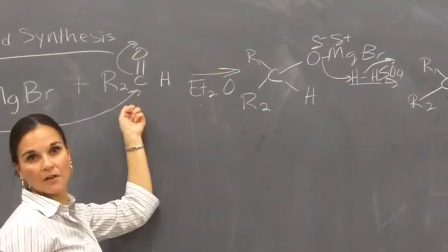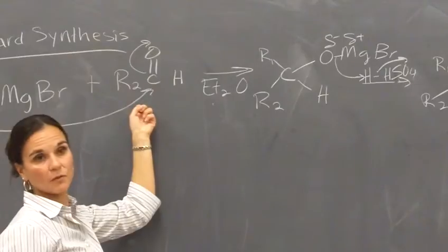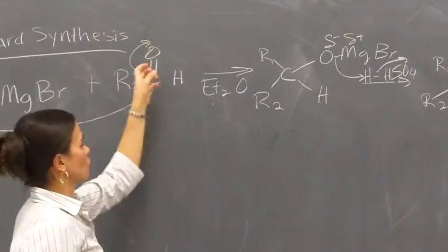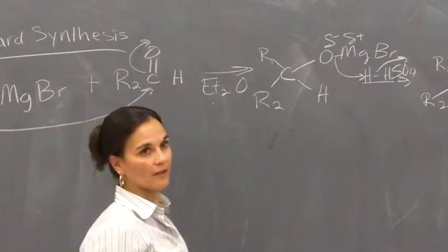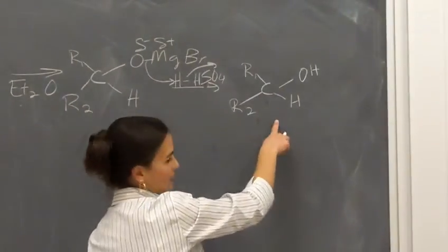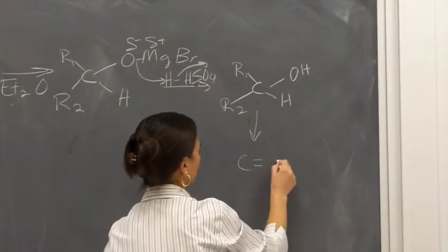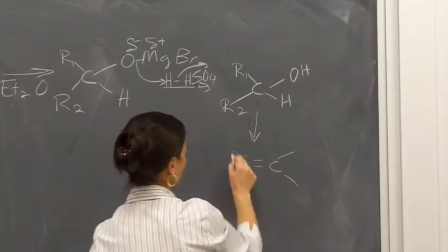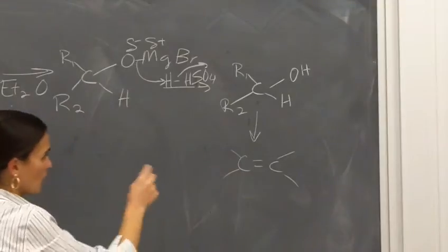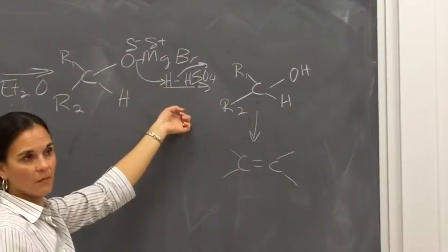So the other part of your half sheet of paper is you have to draw the structure of your product. You have to predict what your product is. So make sure that you do that correctly as well, so you know what you are making. We want to stop here, okay? But it is really easy to get to here if you heat up this step too much, okay?